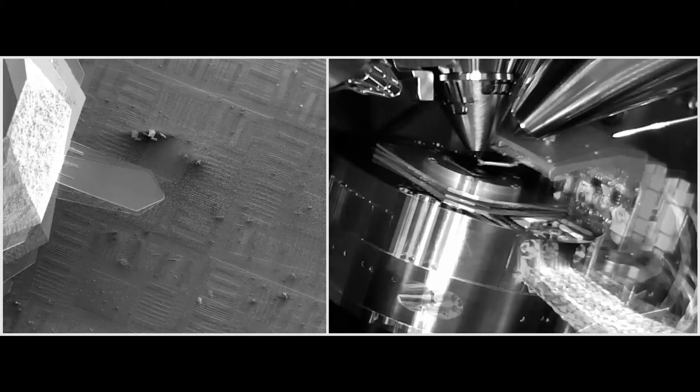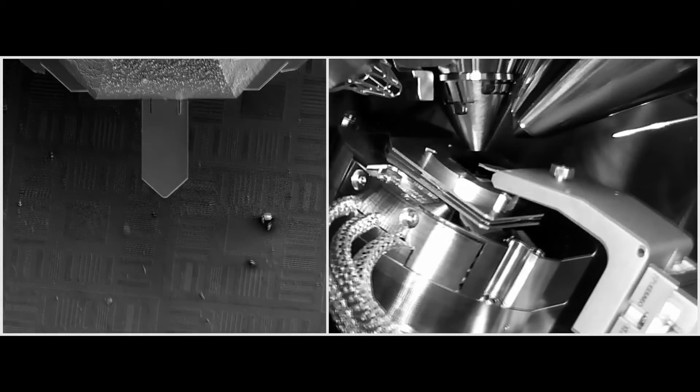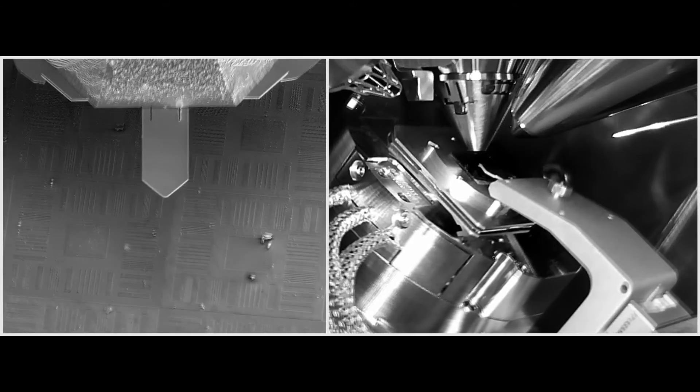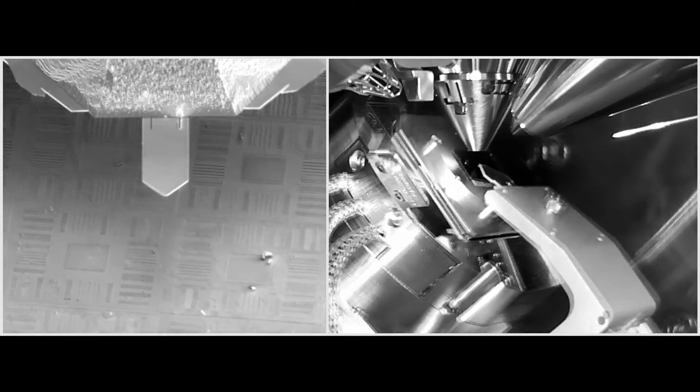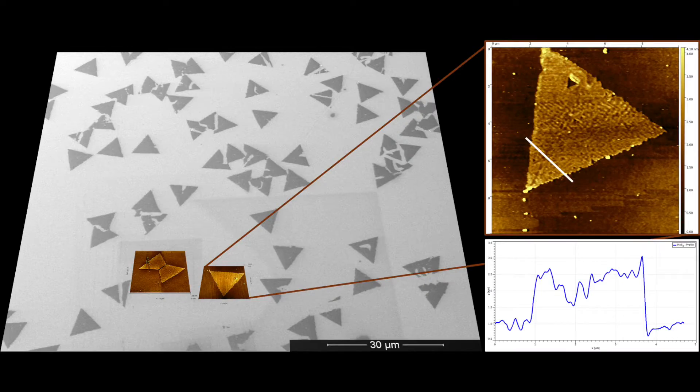The AFM works in contact and non-contact mode. The video shows all degrees of freedom where we can tilt and rotate the AFM inside the SEM.